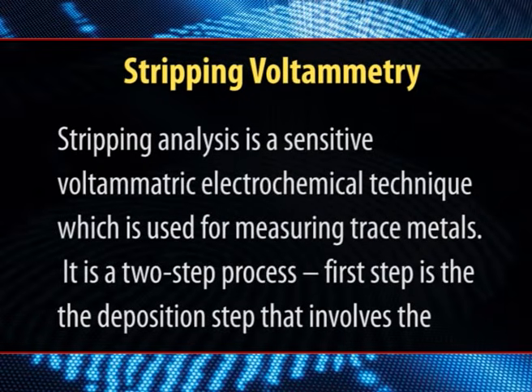Then we have stripping voltammetry. Stripping analysis is a sensitive voltammetric electrochemical technique which is used for measuring trace metals. It is a two-step process.